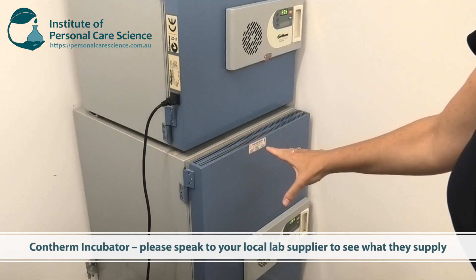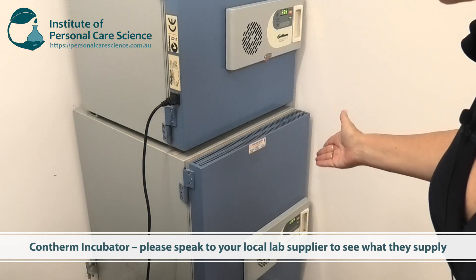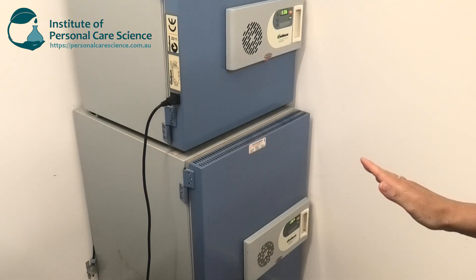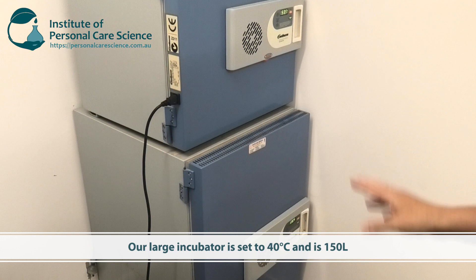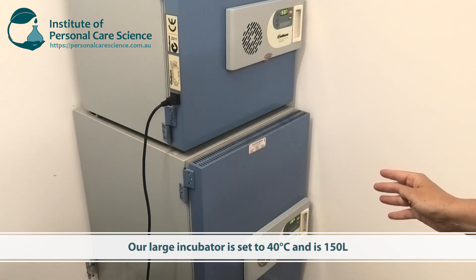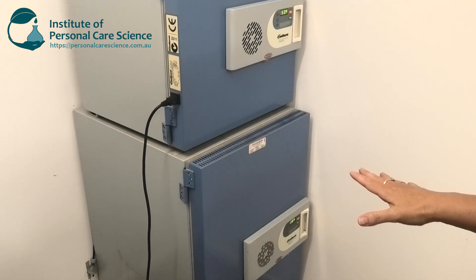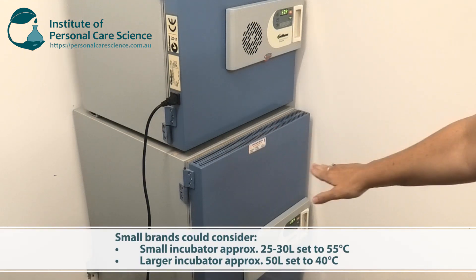The bottom incubator is about the size of a standard bar fridge. This one we set to 40 degrees because we're in Queensland, Australia, and we do stability testing under tropical conditions. A 40-degree incubator represents plus 10 degrees of a 30-degree climate. We can also test European products in this — the 40 degrees then represents either plus 15 or plus 20 degrees for a European climate.